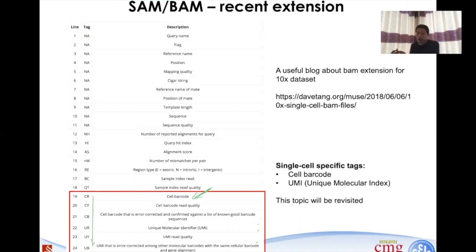Bring them out. Okay, I can also create a smaller file for a cell type. For example, when you do single cell analysis, you say, okay, here are the cells that make a cluster. It looks like epithelial cells, and this is something I'm very much interested in. So give me all these cells. How do I do that? I will need to know what barcodes are associated with these cells, pull them out, and generate a smaller BAM format file that represents that specific cell type.